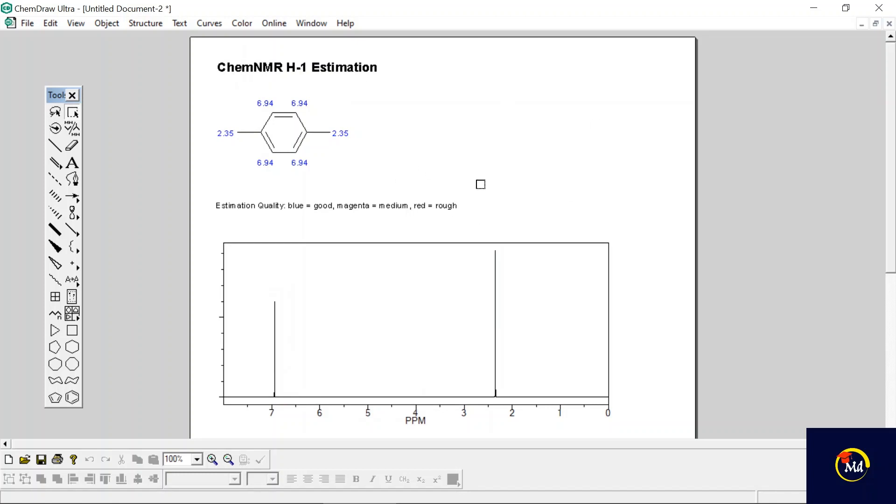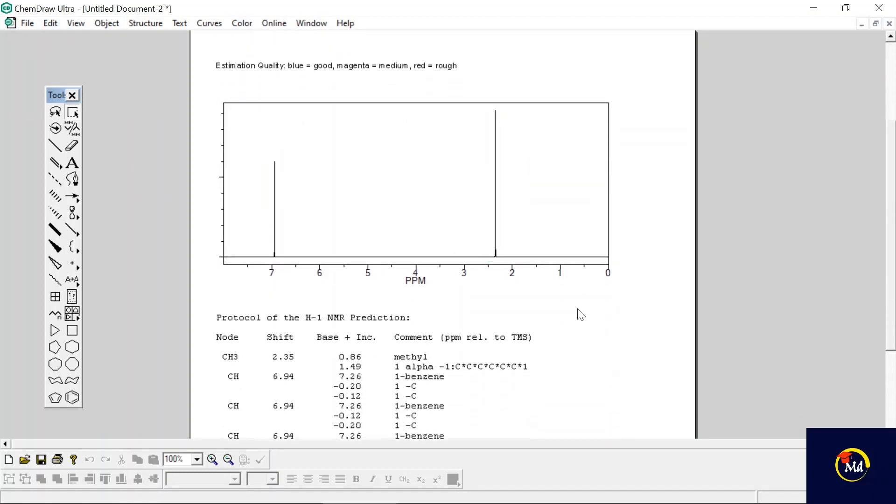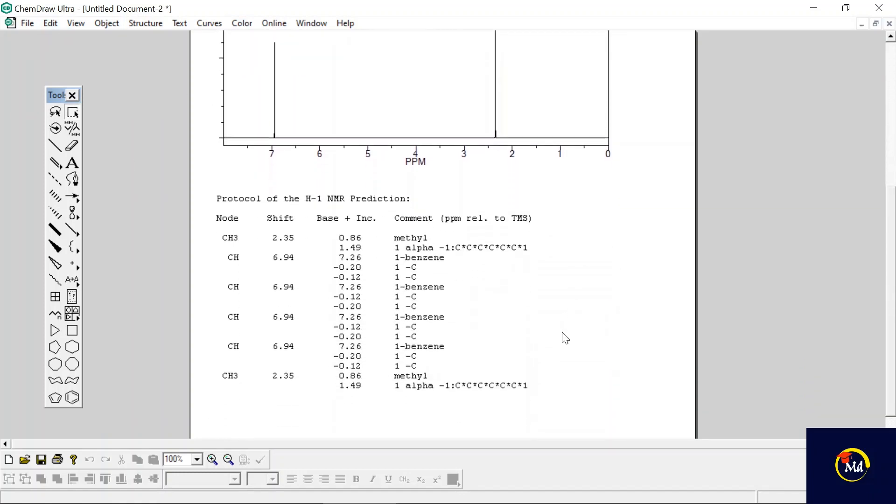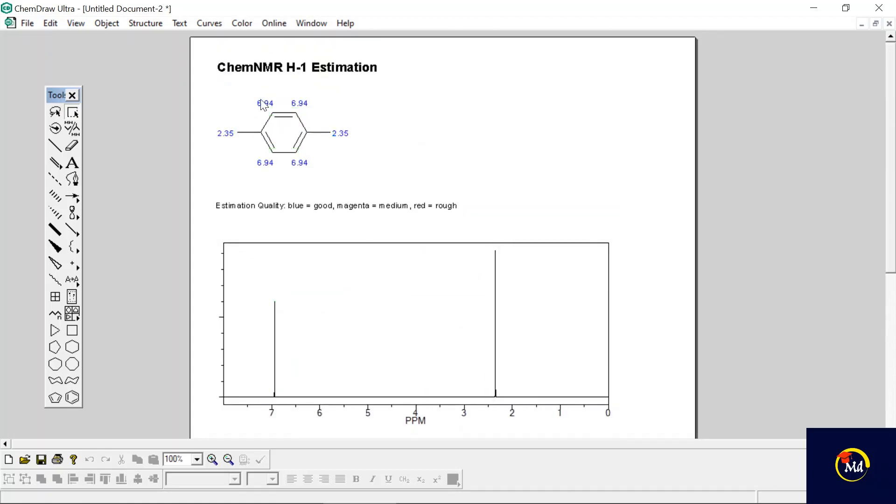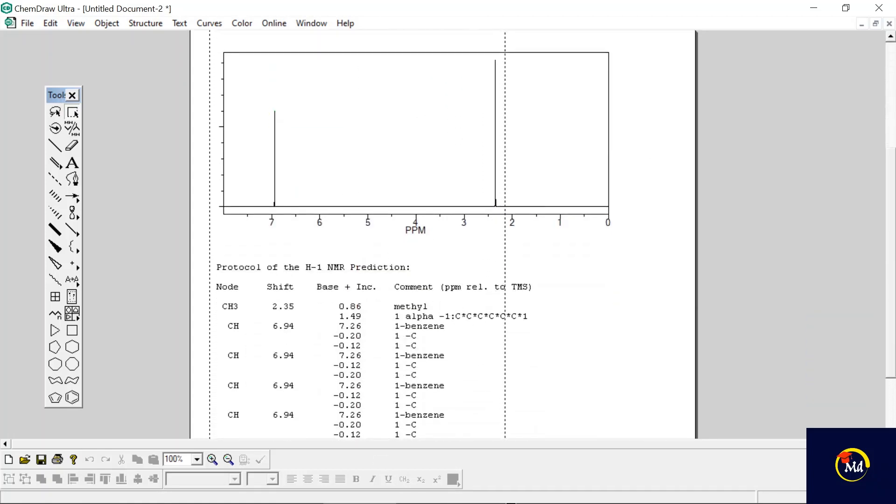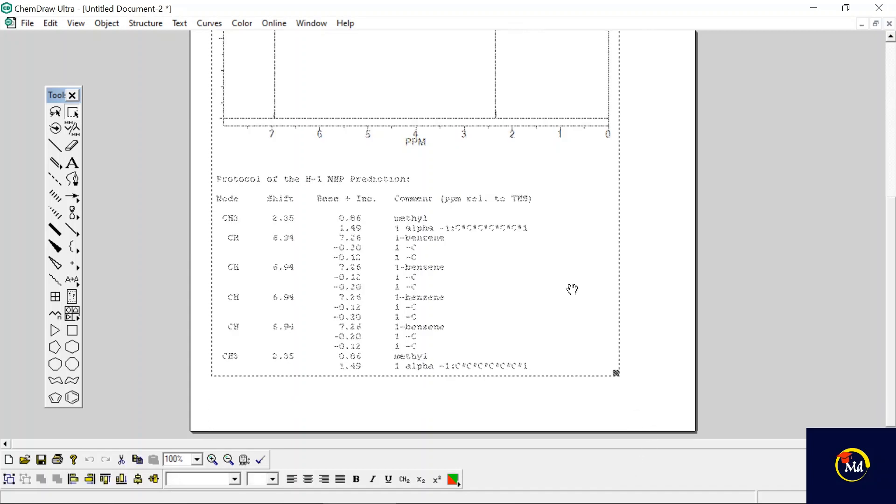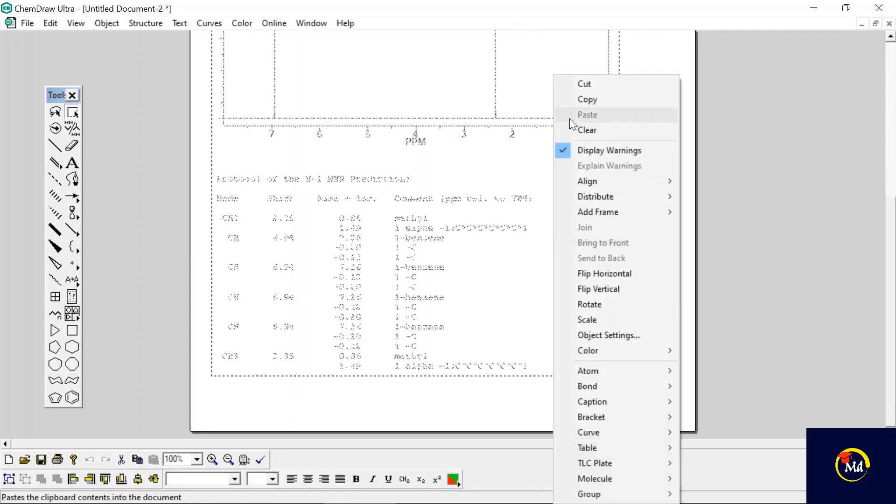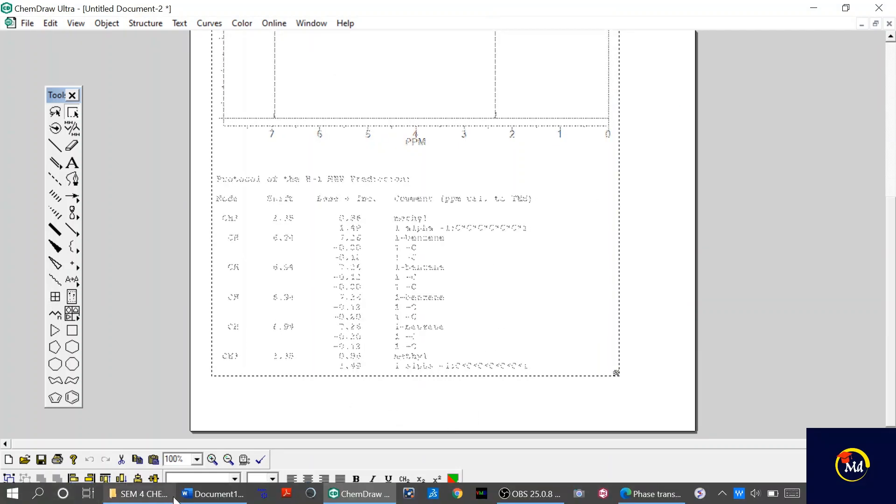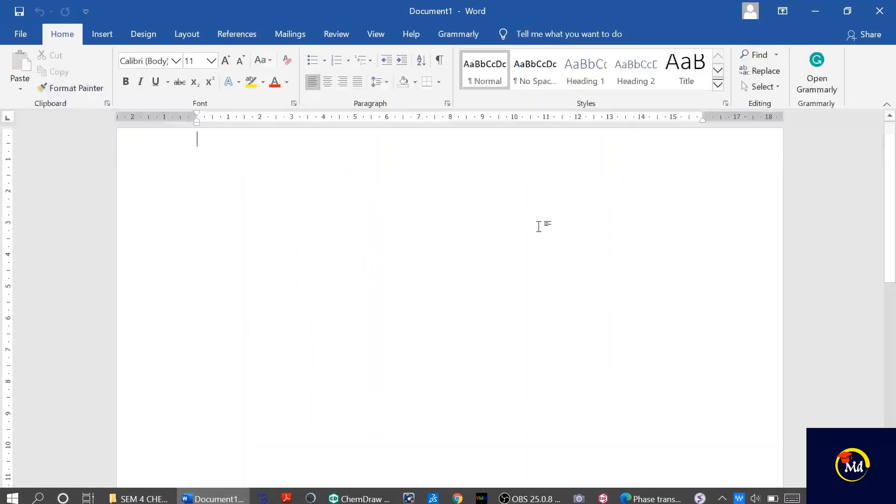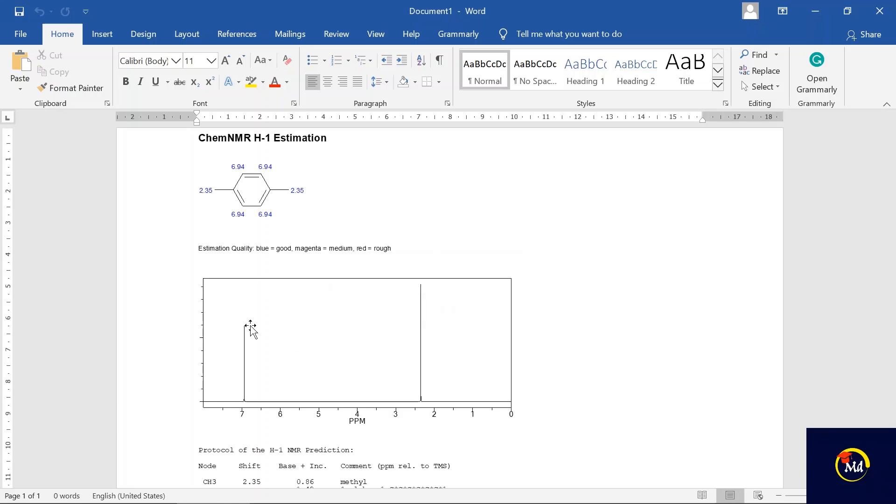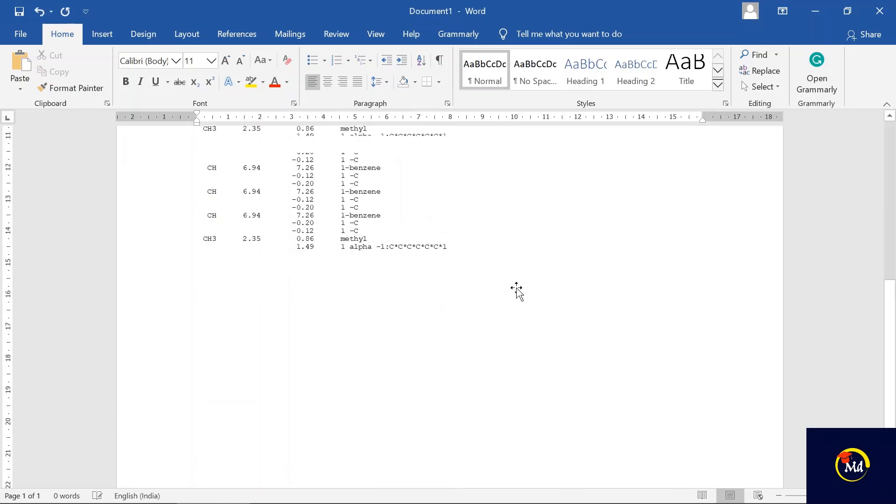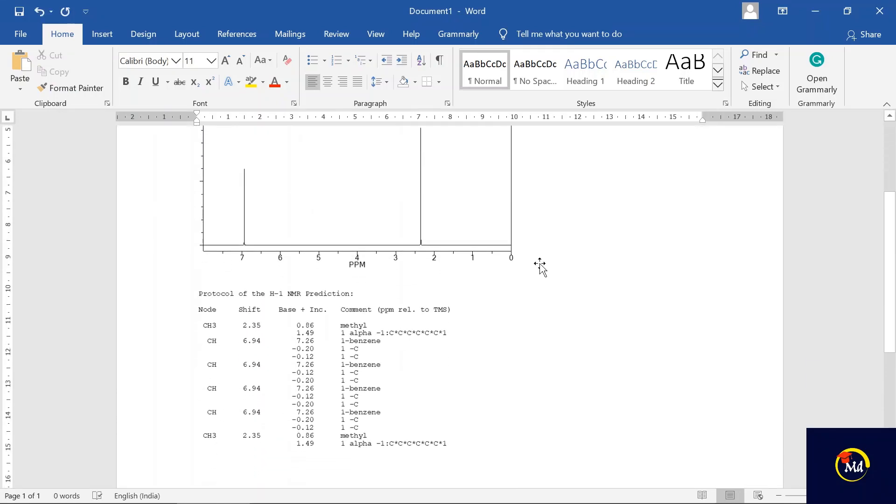Now if you want to copy this, if you want to show it in the Word file, just select this. You can also use shortcut keys like Ctrl+A for selection. Just copy it from here and open your Word file, and then just paste it here. You can see it has appeared here.